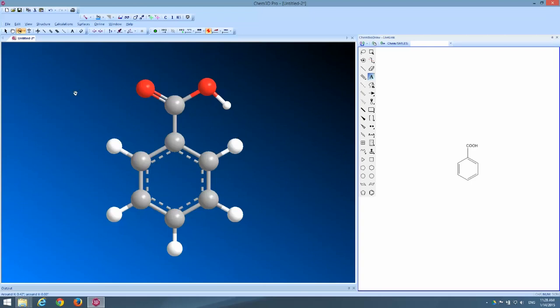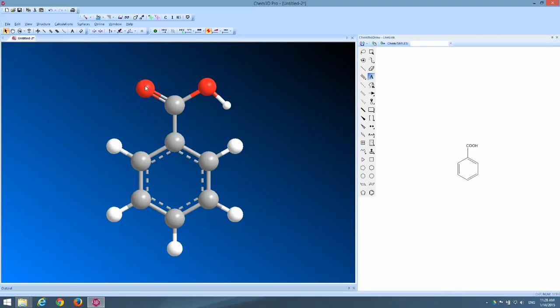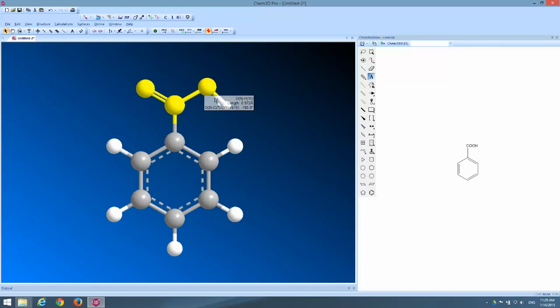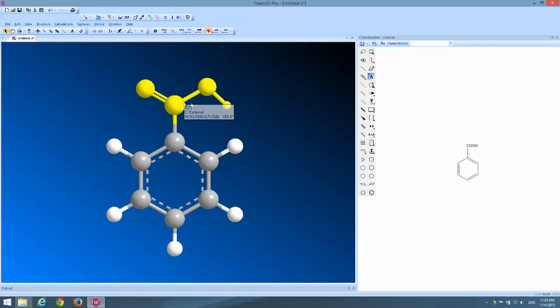So how do I do that? How do I change the position of that one atom in Chem3D? The answer is I have to rotate a bond dihedral angle. Let me show you what I mean by that. I'm going to use the select tool here, the leftmost arrow, and I'm going to grab four atoms.